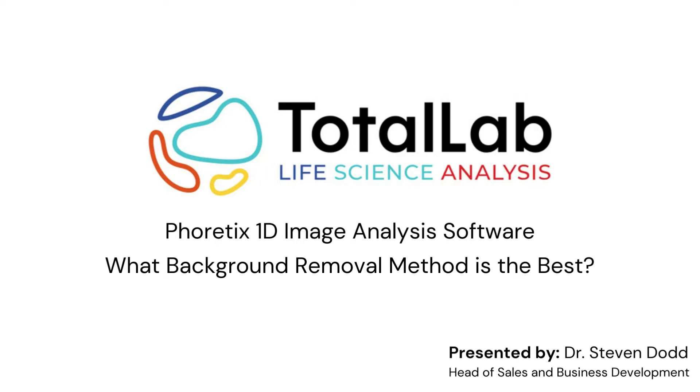So I'm going to run through the background removal options we've got within our Phoretics 1D software, how they work, and how you would decide which is the best background removal technique for your data.